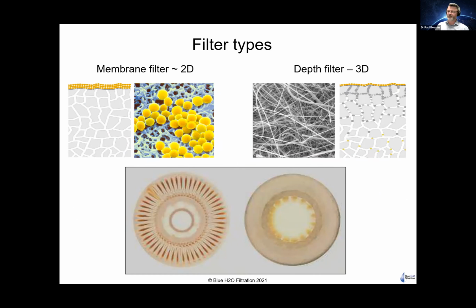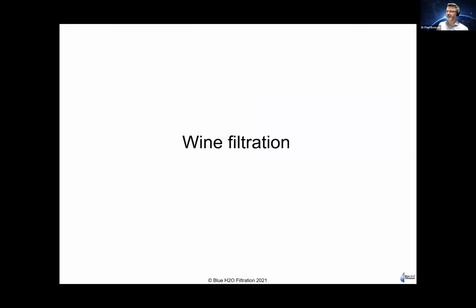much broader matrix. And you can see two examples below there of a pleated membrane, and on the right hand side you can see a depth filter, which is much more like a network sponge, which is meant to take a lot of load. Typically a depth filter like the one on the right is about 80% air, or void space, and that's there to accept load effectively.